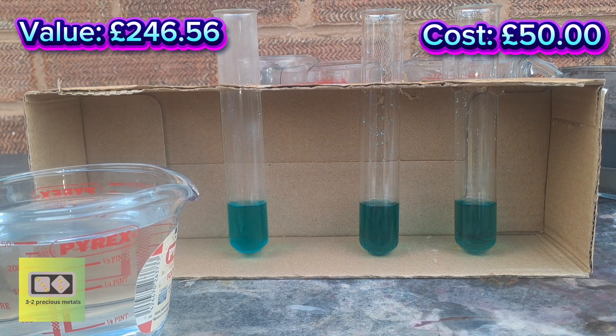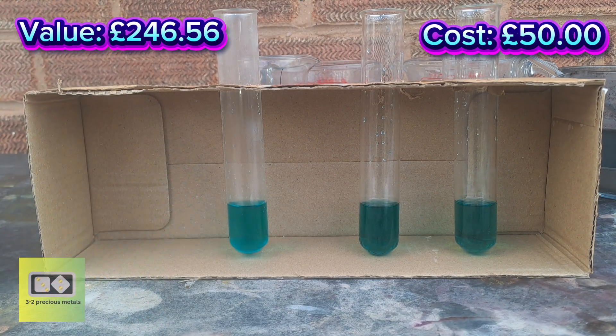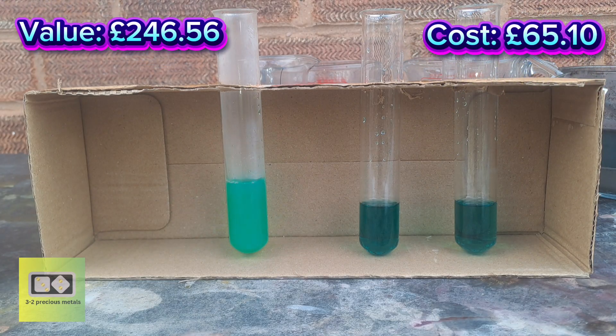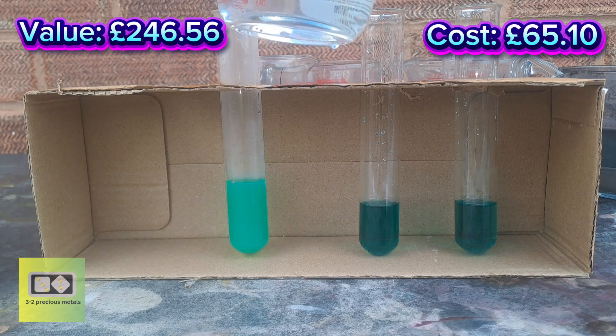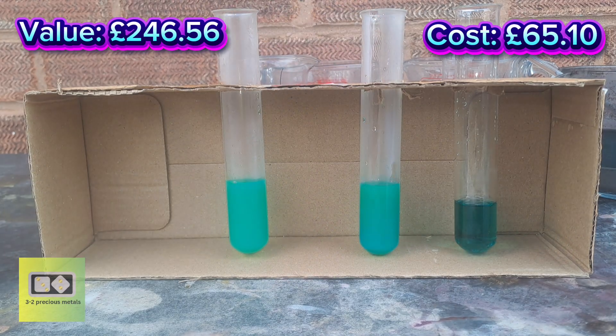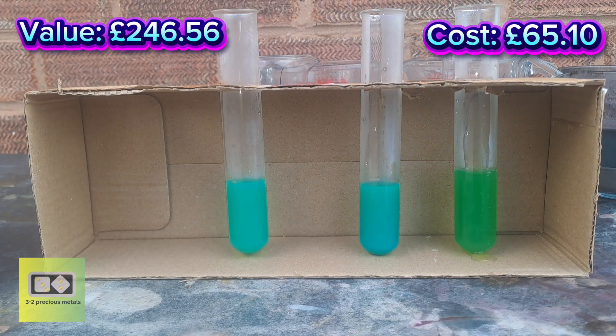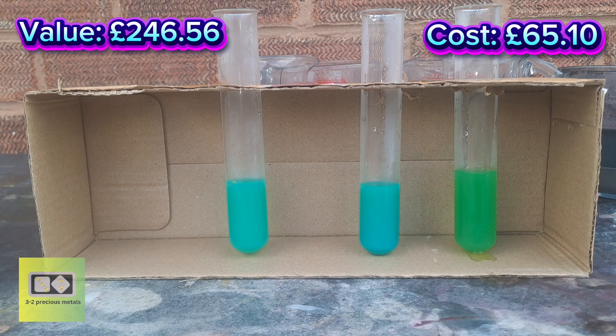I've got three different extractions of that material. I've got some sodium chloride here — we're going to see if we can precipitate any silver. There's a small amount in that one, a bigger amount in that one, and barely nothing in that one. The one on the right is from the first extraction, the middle is from the second, and the left is from the third extraction. I wasn't expecting that much silver in the first one to be honest — that would be mainly base metals — but at least I know there's a bit of silver in there.